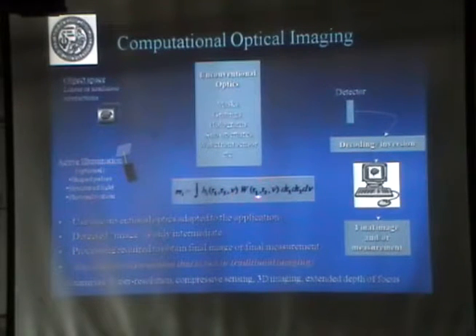That's why I'm showing here the power spectral density, which relates to this coherence function, and this is a generic point spread function in multiple dimensions. This is a kind of teaser, because nobody works with so many dimensions. But it tells you that there are more generic transformations you can do here. Ultimately, if we try to make an image here, it's 2-dimensional. So if you have a 7-dimensional function and you get a 2-dimensional function, you're essentially making a projection, right? You're getting part of the information, and you're losing most of it.